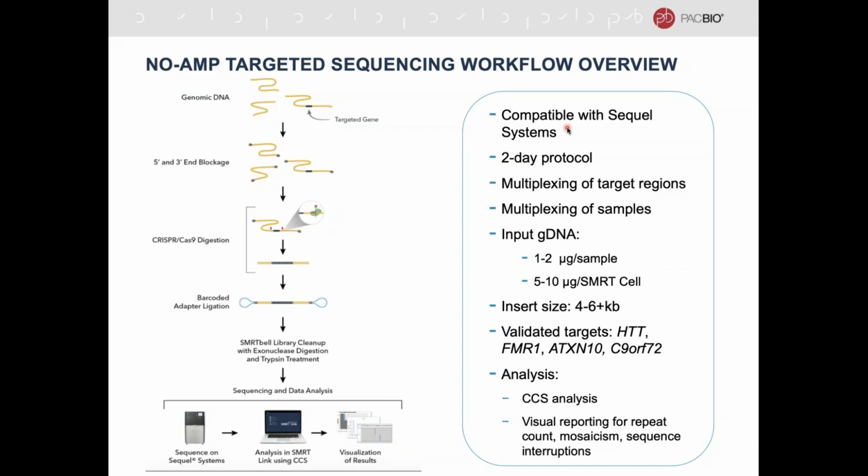So all in all, again, the NOAMP protocol is compatible with both of our sequencing systems. It's a two-day protocol, roughly. You can choose to multiplex several target regions if that is what your study design needs, or you can also choose to multiplex several samples.